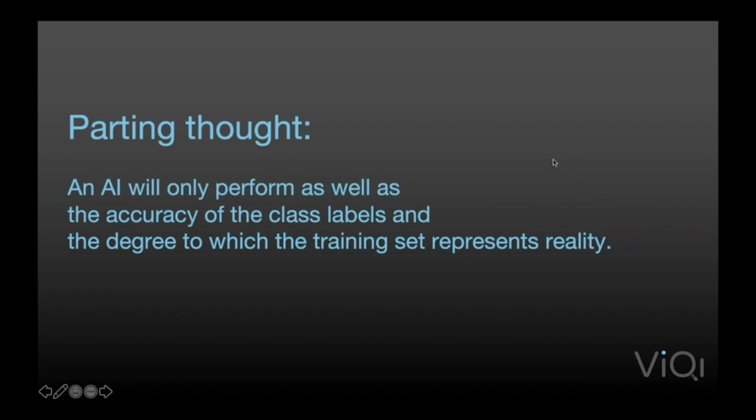And so, first of all, when you train these AIs, you don't want to necessarily rely on a single person's idea of what is in this image if you're using image content as your training basis. You might want to get multiple reads or get a consensus read to get a more accurate class label. And of course, you have to be absolutely conscious about bias, because these are kind of black boxes, and so they could be latching on and learning from things that you really didn't intend.